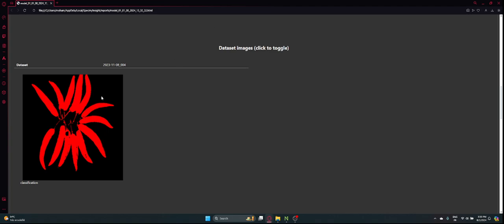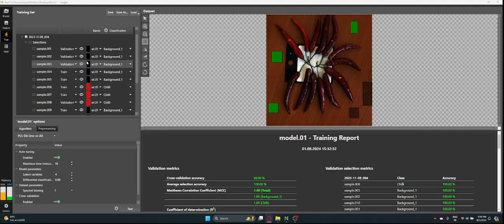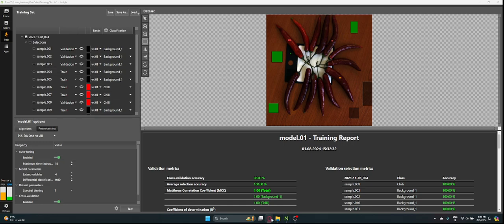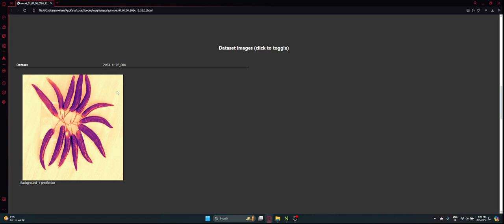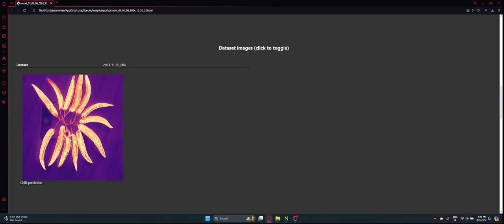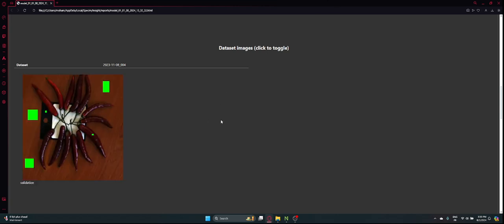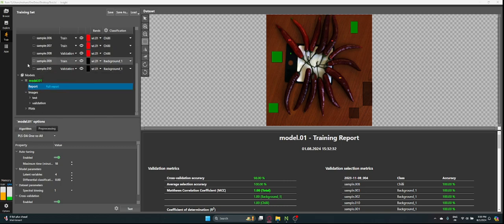I mean, as I mentioned, you need to have a lot of sampling, like what I just did earlier. This is actually a very quick sampling, but you can already see the result is quite good. I click on this. The background selection didn't select anything but the background. The chili selection only selects chili, except this part, this bruises here. We need to train it on detecting the bruises. Now you can see the selection of the chili. Yeah, looks good.